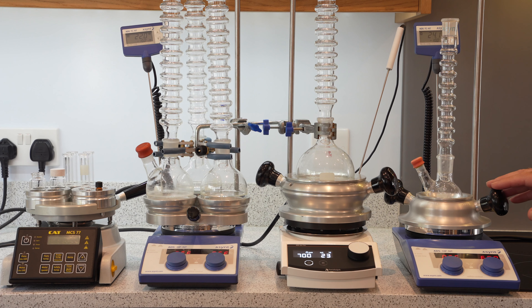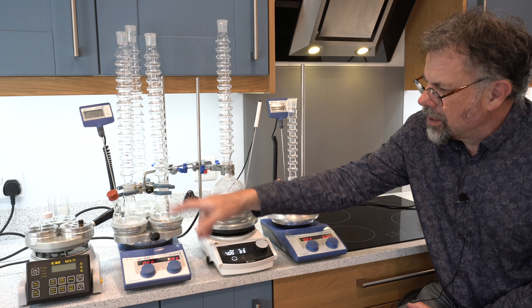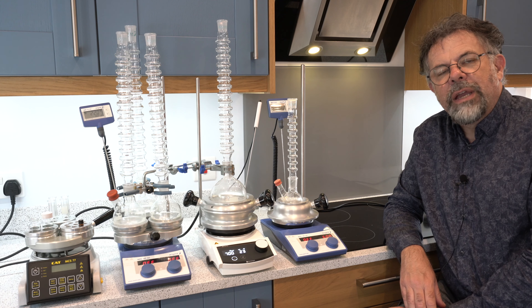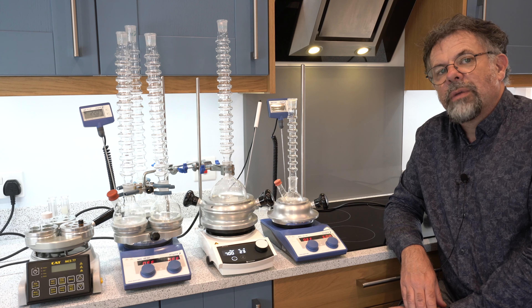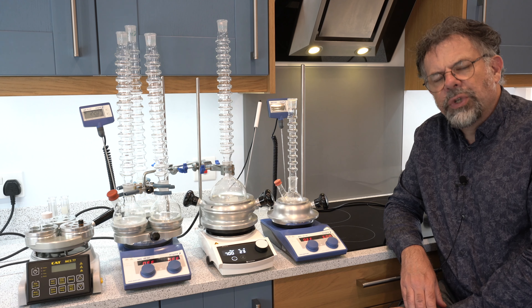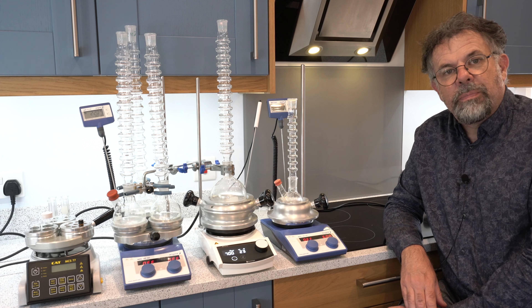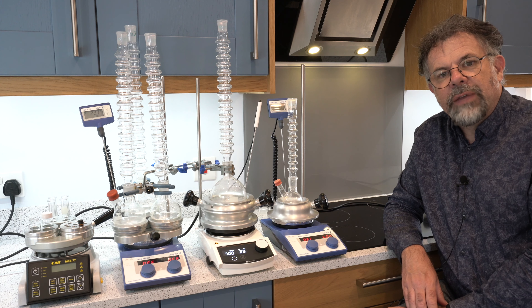All DrySyns come with safety handles for safe removal from the heating source in an emergency, or if someone were to pick one up and not realize it was still hot. These are not optional — these come as standard. So please be aware when you purchase DrySyn that we really don't compromise on that safety issue.